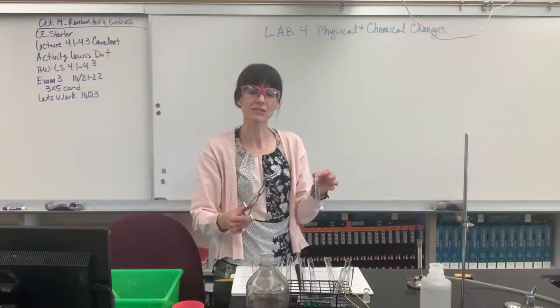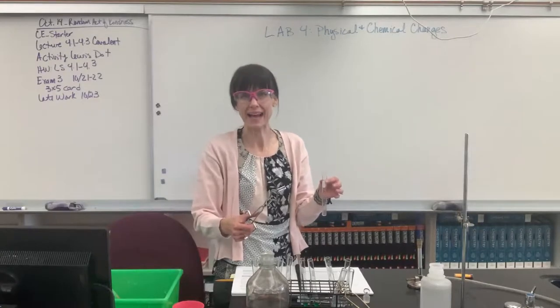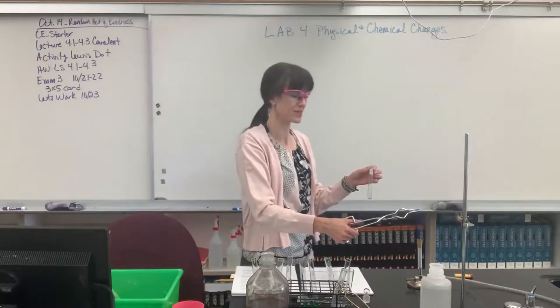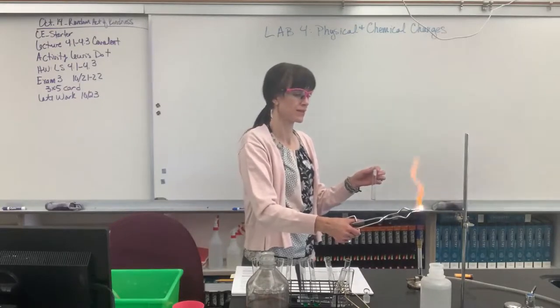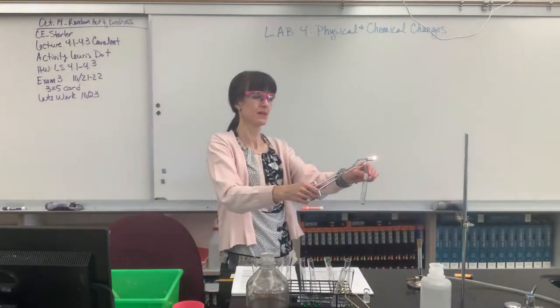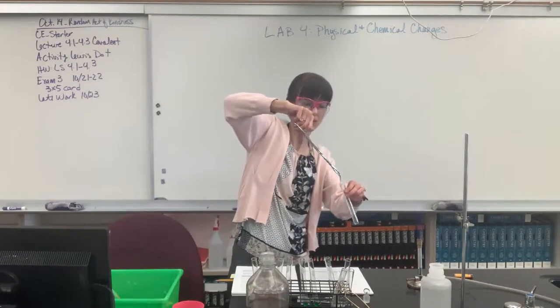I don't know if you could see it or not. After it burned, it changed from that really pretty shiny to a white. It looked like white ashes. So let me burn this last little bit of metal that was underneath the crucible tongs. Again, super bright, woohoo! After it's done burning, it's this white ash. I'm going to put that in the test tube.